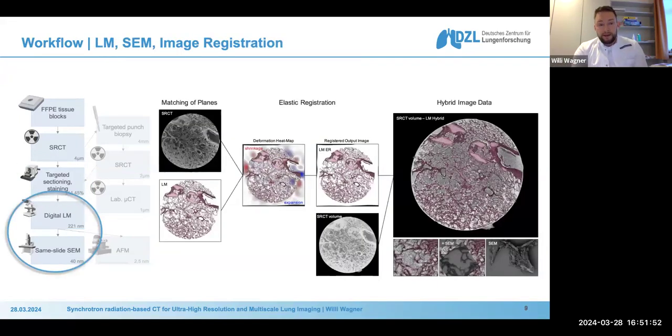And once we have sliced our envisioned piece, we then do the staining. It turns out that there is always some micromechanical deformation happening to your tissue during the microtome slicing.